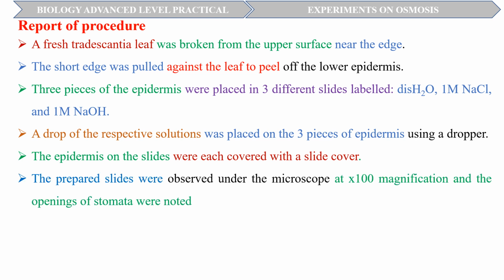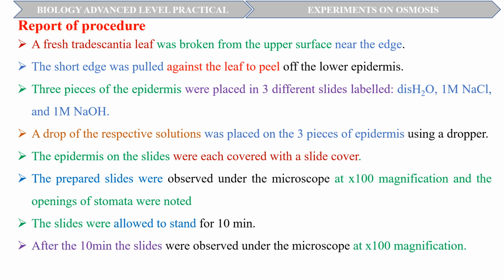The prepared slides were observed under the microscope at times 100 magnification, and the openings of stomata were noted. The slides were allowed to stand for 10 minutes. After the 10 minutes, the slides were again observed under the microscope at times 100 magnification. The openings of stomata were again noted.